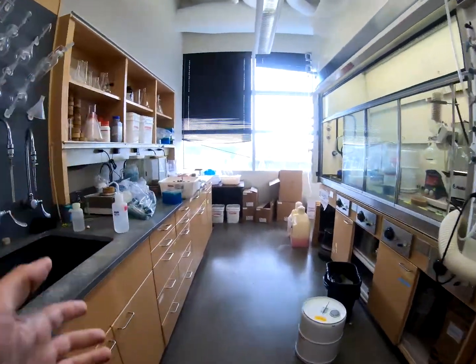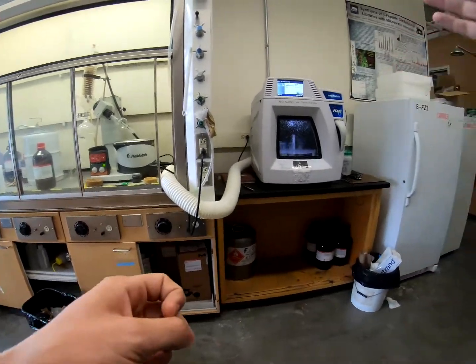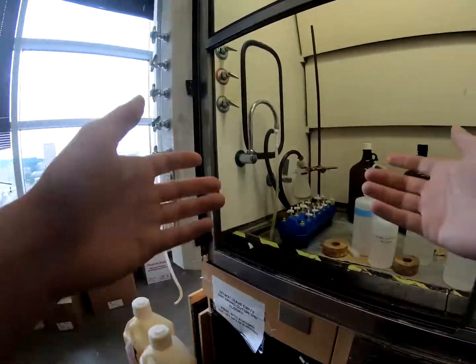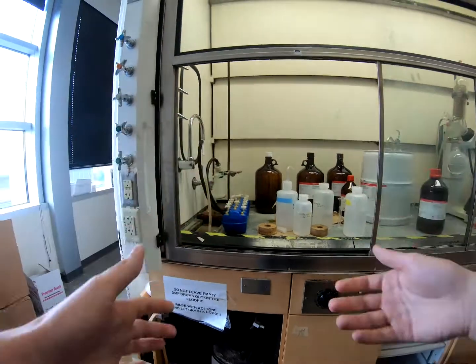You walk a little bit further down the alley over here, and now we've got one of our manual peptide synthesis stations. So here's our microwave, which we do our deprotections and our couplings in, and our prep station over here, which has our aspirator, which is used to drain off solvent and reactant material that we have in our syringe that we're using as the reaction vessel.